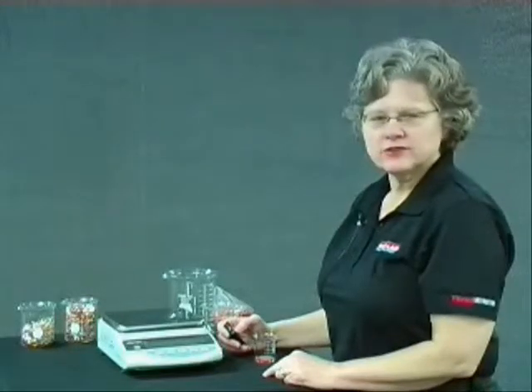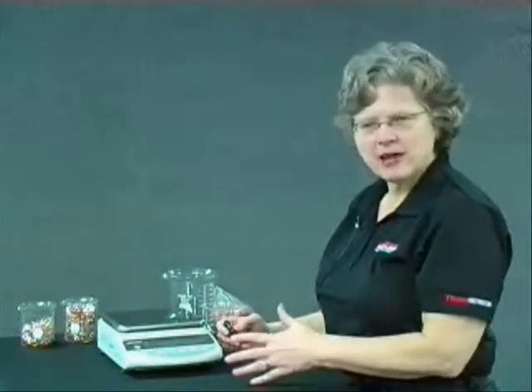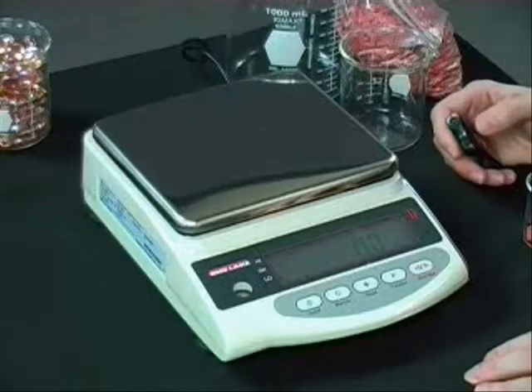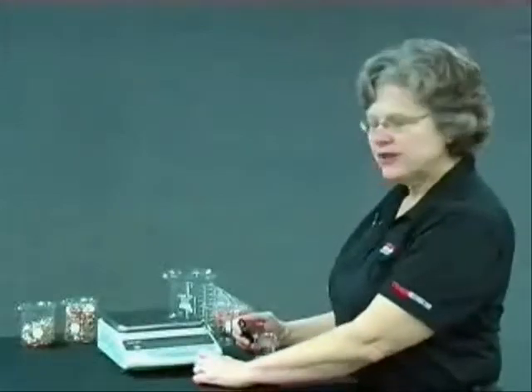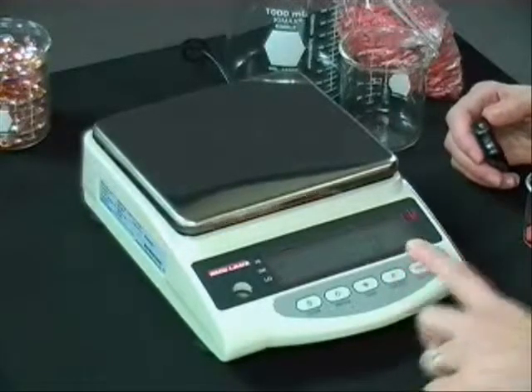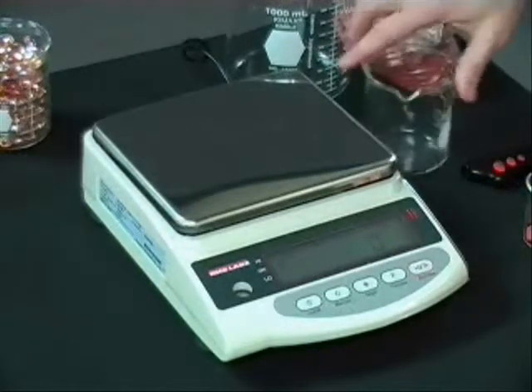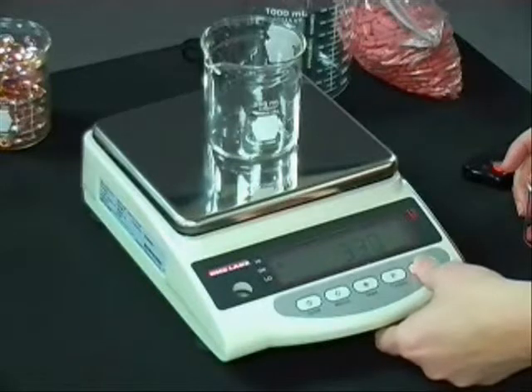Although there are subtle differences between all the different balances, the basic functionality of the different counting modes and percentage modes are the same. So in this section, we're going to show how to utilize those functionalities. The first function we're going to go through is how to count on the balance. To activate the function key — if I have it set up as one of my main functions — I just push the function button and go to pieces. So right now I have pieces displayed on my display. To start counting, I simply put my empty container on the balance and push the tare button.